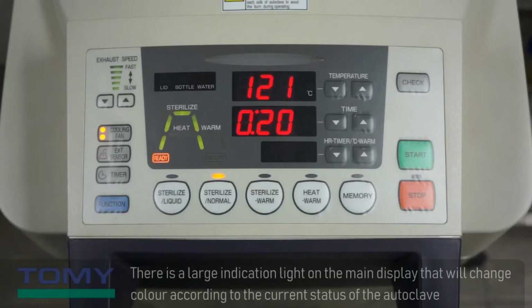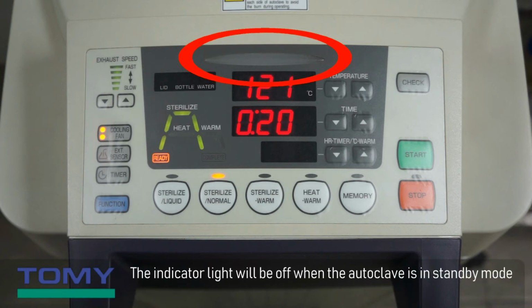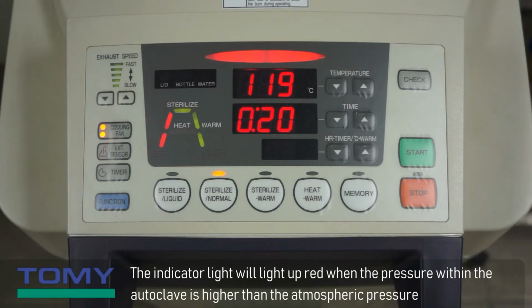There is a large indication light on the main display that will change color, according to the current status of the autoclave. The indicator light will be off when the autoclave is in standby mode. The indicator light will light up orange when the autoclave is heating up or cooling down. The indicator light will light up red when the pressure within the autoclave is higher than the atmospheric pressure.